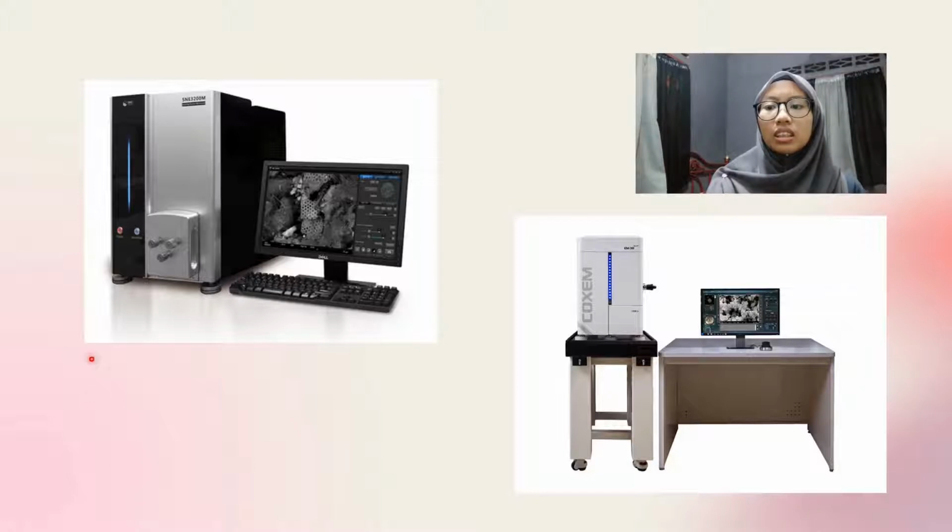This is the image of desktop SEM. It is connected with the PC, so the result will come up over here. We put the sample here and the result will come up here.